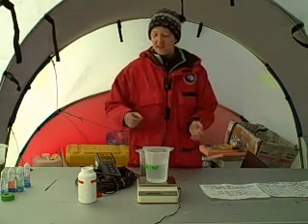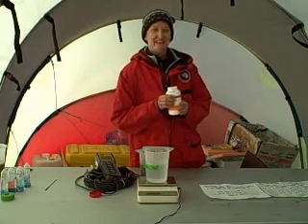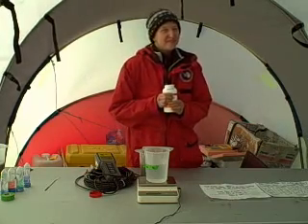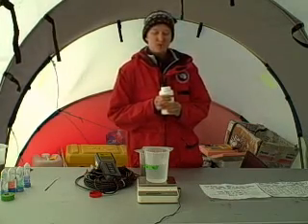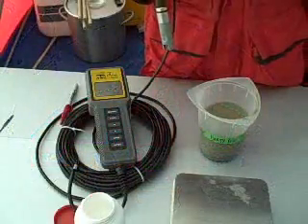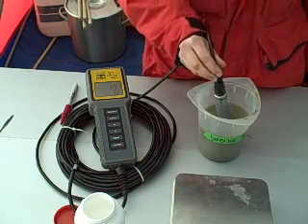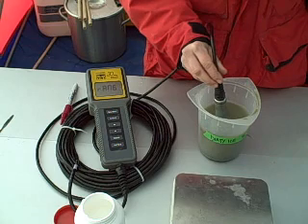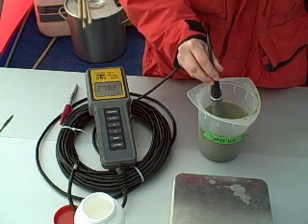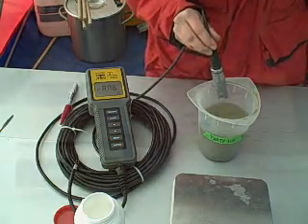We're going to record that and then slowly add salt until the conductivity matches that of the dirty ice, and then record our final mass. Hopefully this will tell us how much more salt is in the dirty ice than in the clean ice. So the first step is to take the conductivity of the dirty ice to see what we're shooting for. So we're going to shoot for around 2,777. So that's what number we'll shoot for.